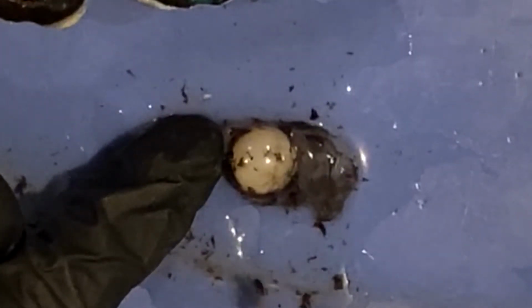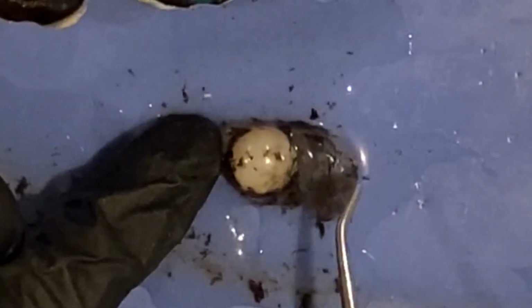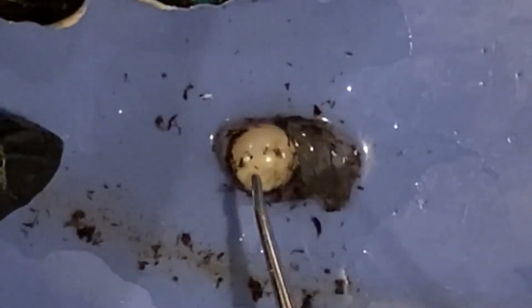The additional liquid you see on my dissecting tray is actually the aqueous humor, which is found in the anterior segment. The pressure from these two types of fluid actually helps to, again, maintain the shape of the eye, but if the pressure becomes too high, it can lead to an eye disorder called glaucoma. And I also mentioned this lens, that the flexibility of the lens is what allows us to see things up close.